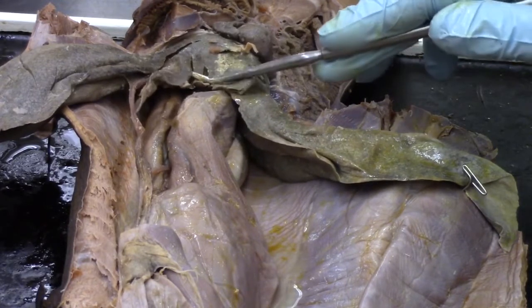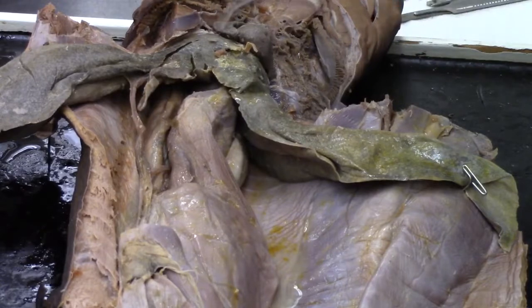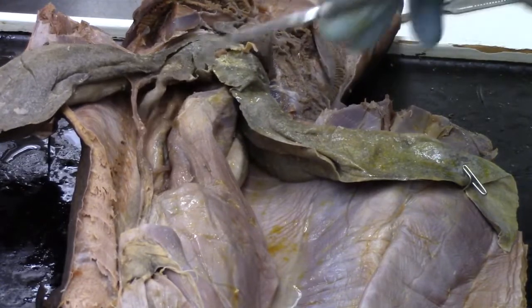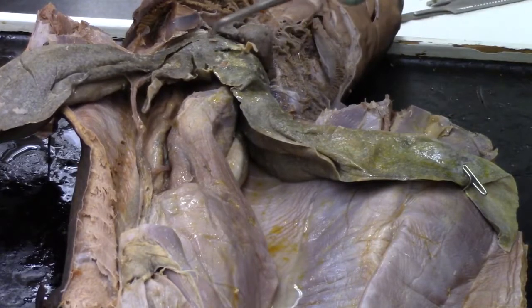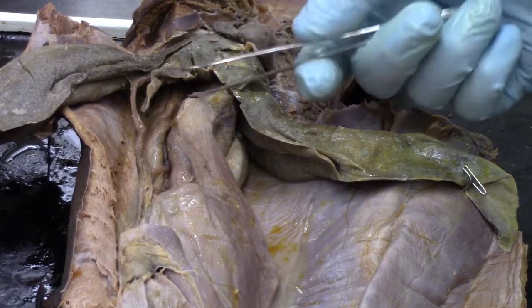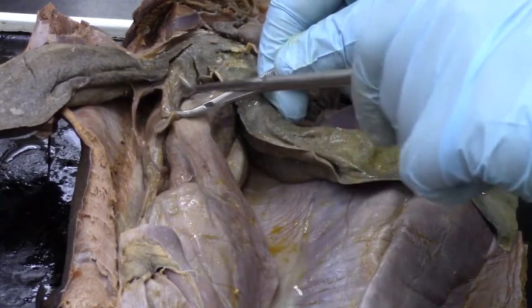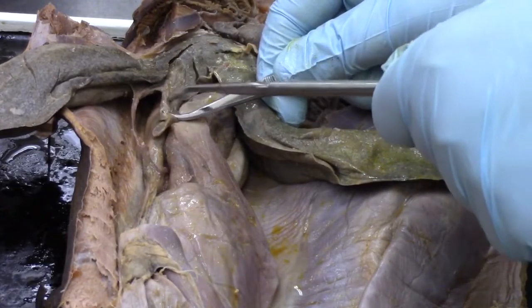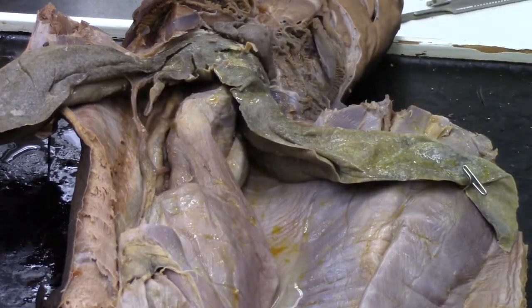And at the very tip, this one's third lobe is structured a little bit differently than I'm used to seeing. It's actually separated out a little bit. Normally this is one kind of more obvious triangle. At the tip of that triangle, and kind of along the one side, there is a flattened pouch that we can see running along right here. And that is the gallbladder. So that's going to be the spot where bile is stored.